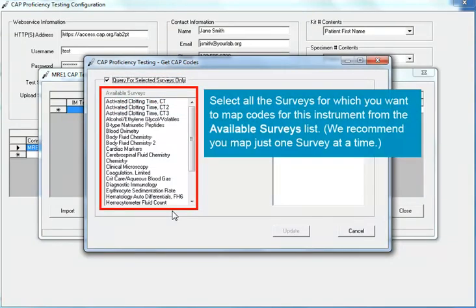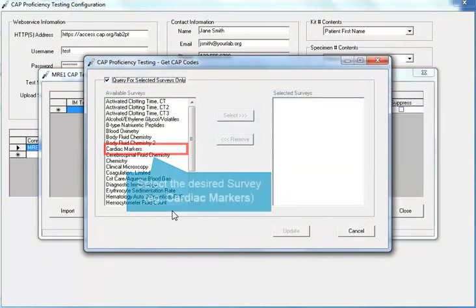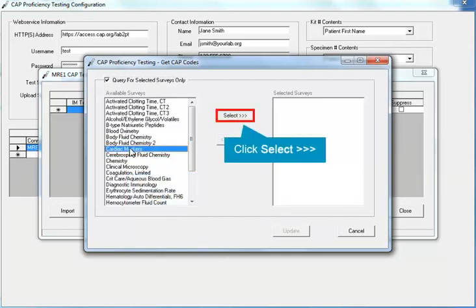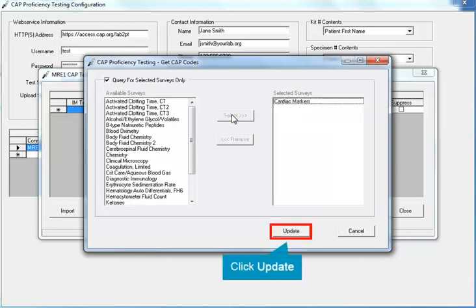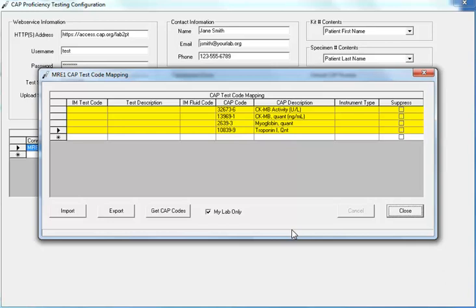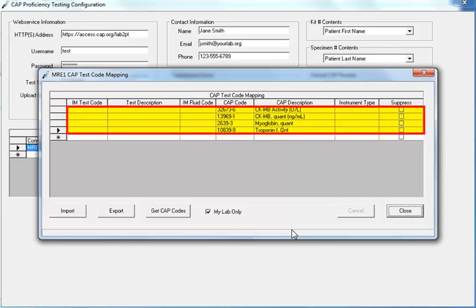Now select all the surveys for which you want to map codes for this instrument from the available surveys list. We recommend you map just one survey at a time. In this example, we will map codes for the Cardiac Markers survey. Select Cardiac Markers, click the Select button to move the survey to the Selected Surveys list, and click Update. The CAP code mapping screen is updated with the CAP codes for your selected surveys.